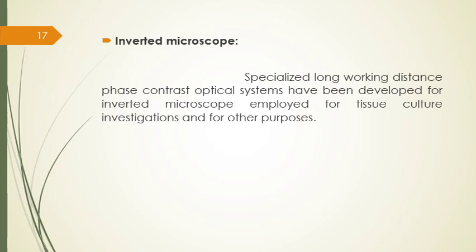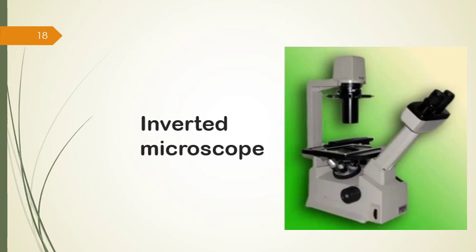So these inverted microscopes are more durable and easy to use for cell microscopy and tissue culture work, including diagnosis of tumor cells. So specialized long working distance phase contrast optical systems have been developed for inverted microscopes, as you observe in this figure. So this one is an inverted microscope.